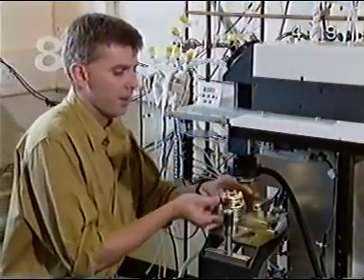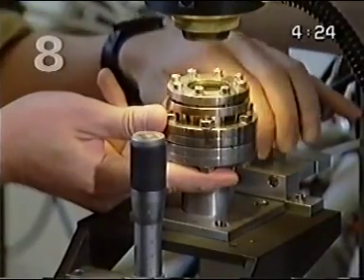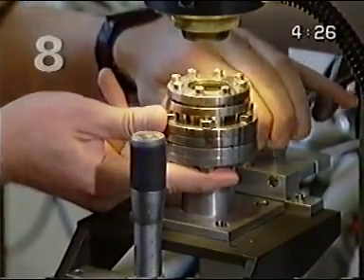The carousel is inserted into a vacuum chamber, and the samples can be selected by viewing with a video camera.